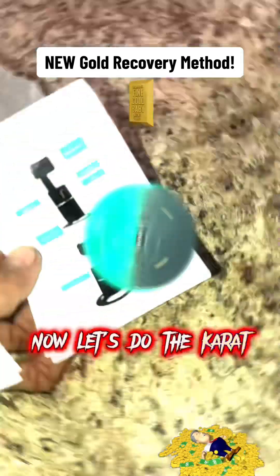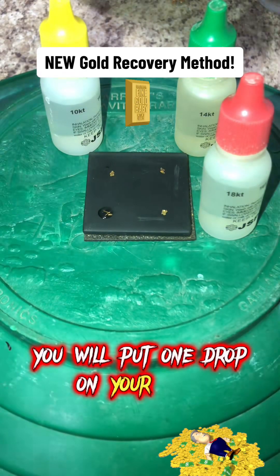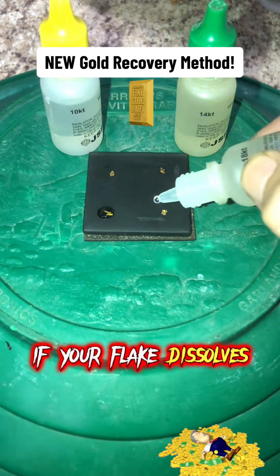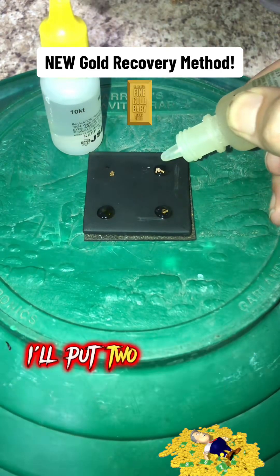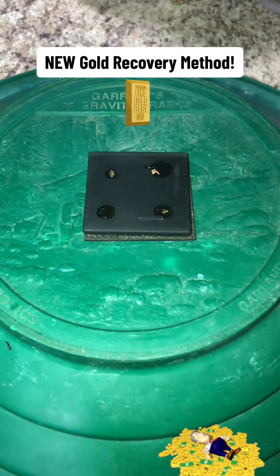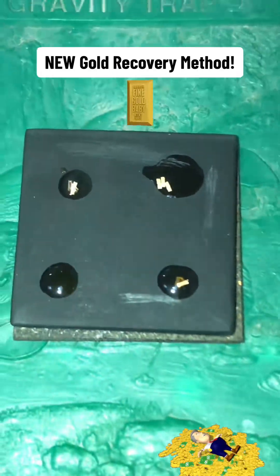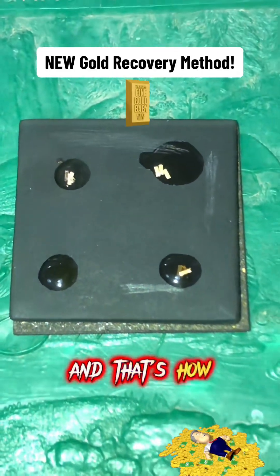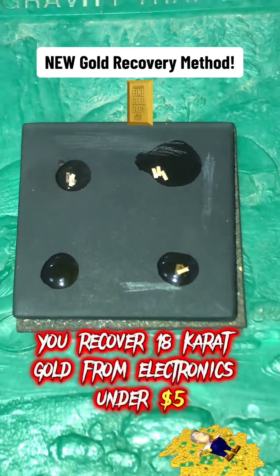Now let's do the karat test. When doing the karat test, you will put one drop on your flakes. If your flake dissolves, it is not that karat. If it does not dissolve, it is that karat. I'll put two gold flakes on each — and that's how you recover 18 karat gold from electronics for under 5 US dollars.